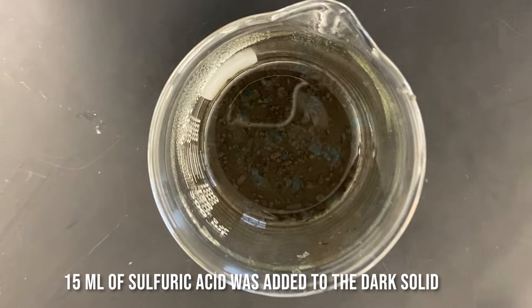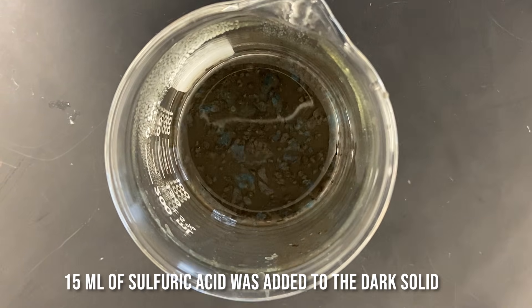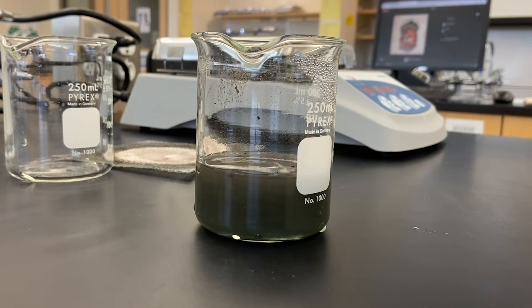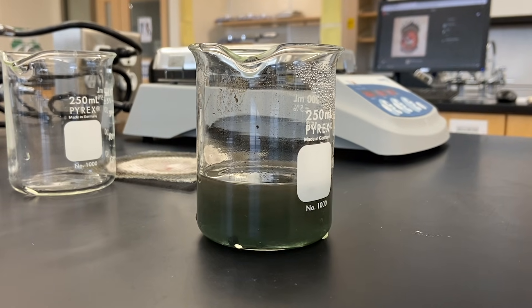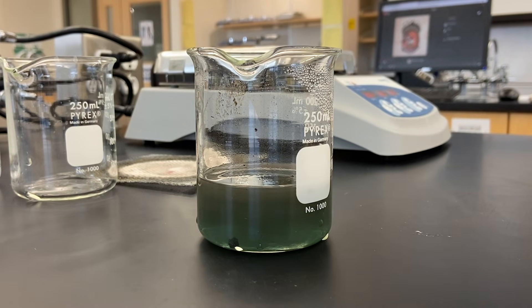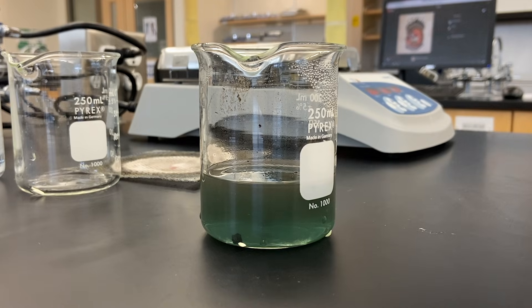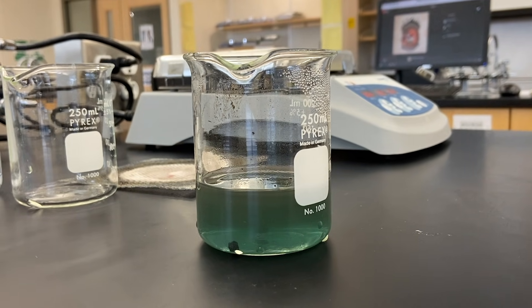Now we are going to add in 15 ml of 6 molar sulfuric acid. As you can see, it looks a little chunky, so we're going to give that a little stir. Now that the solution is turning clear, we can make an inference that the reaction is complete.